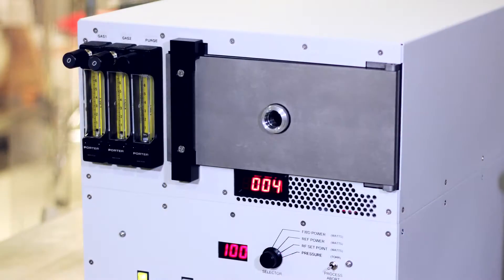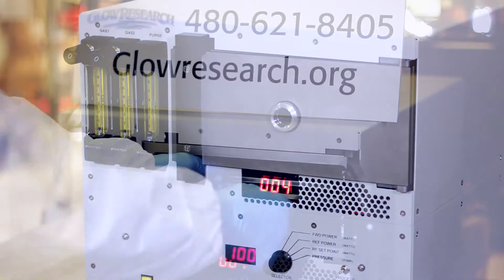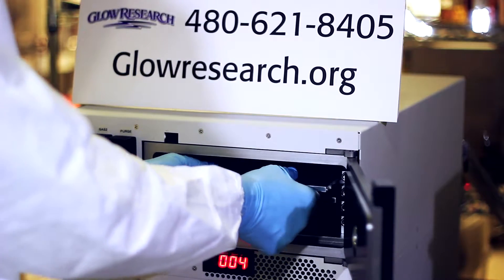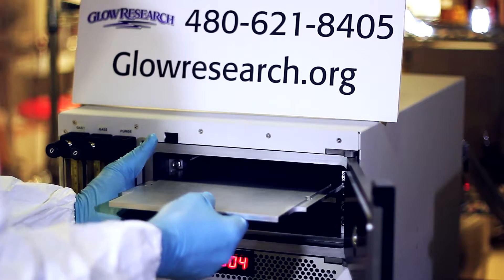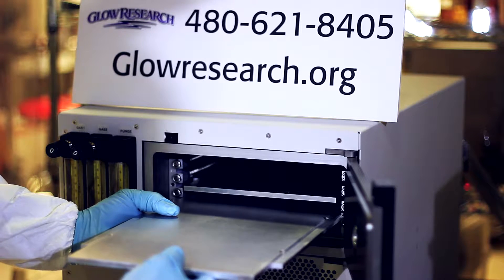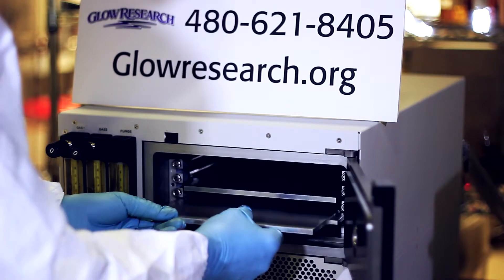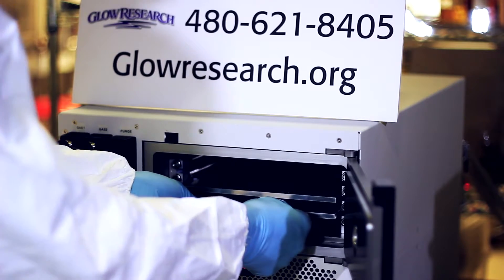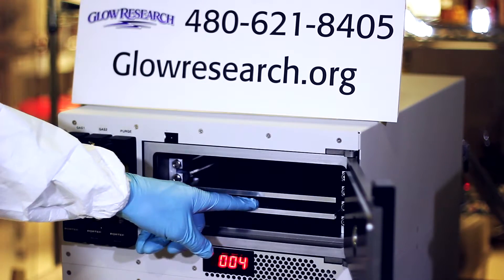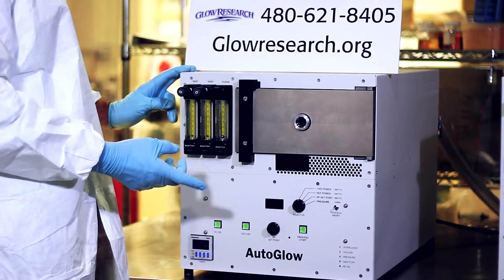The Autoglow 200 has an anodized aluminum chamber and the user can easily configure the adjustable shelves for RIE bottom powered or plasma top power processing. The system is used for plasma activation, organic removal, plasma cleaning, removing photoresist, pre-bond cleaning activation, PDMS bonding, FA work, and plasma de-scum.